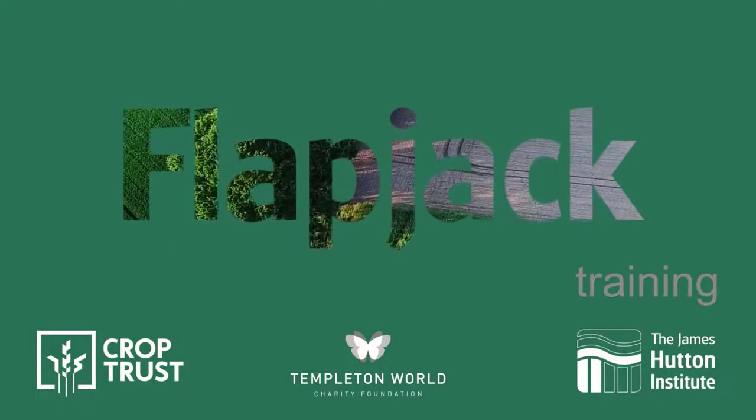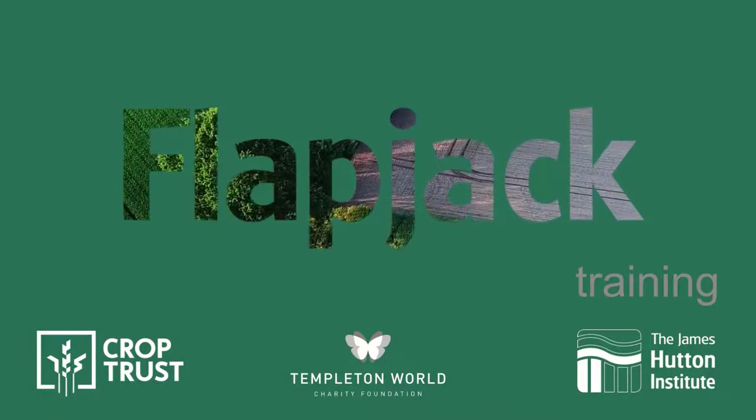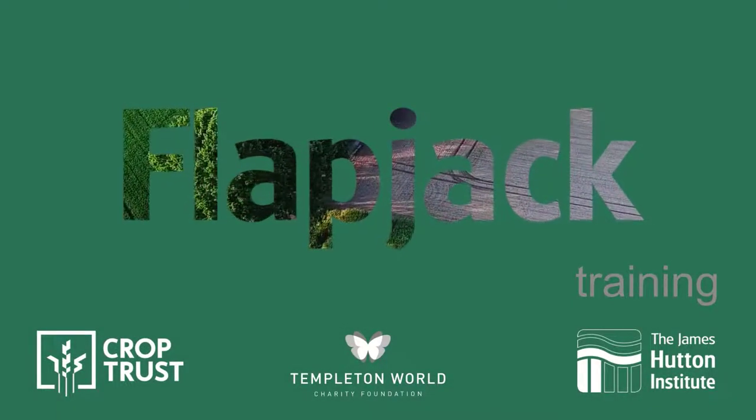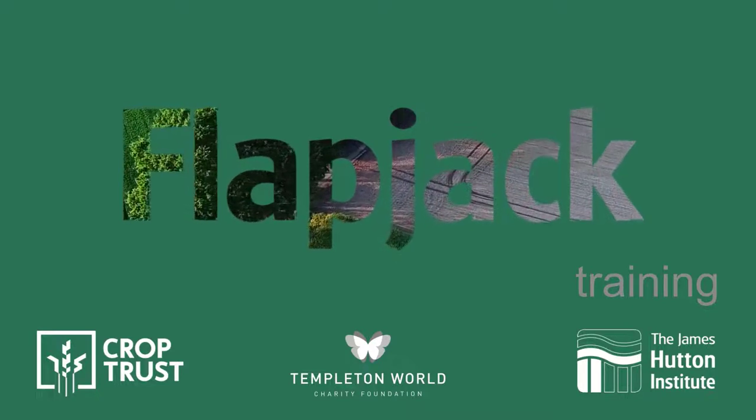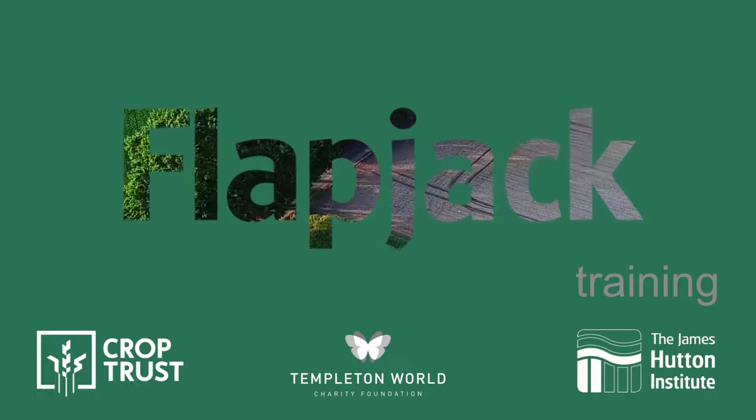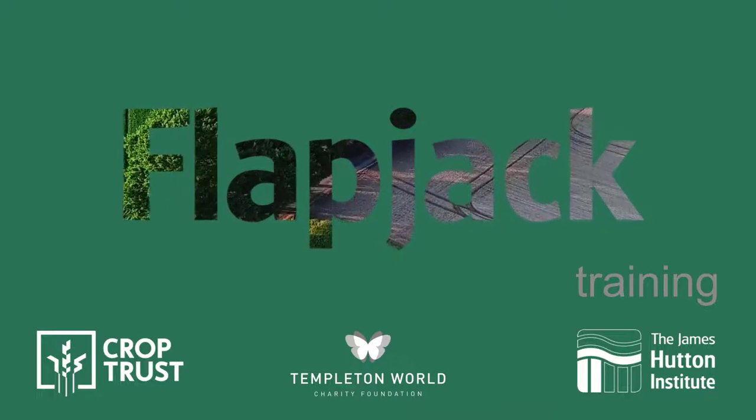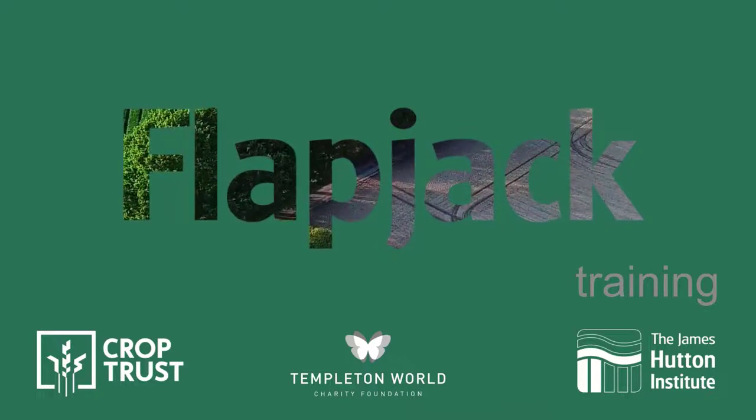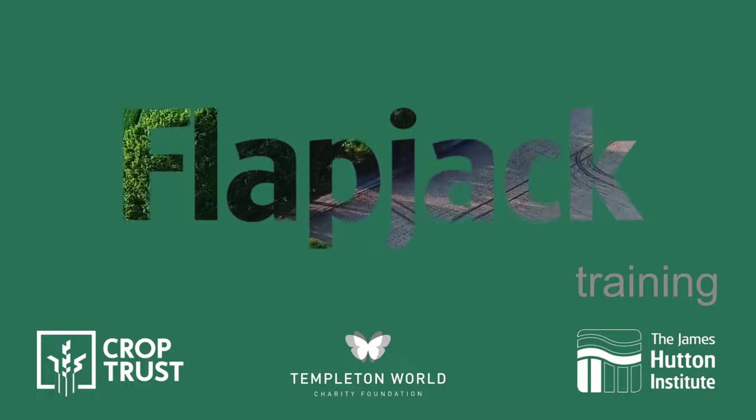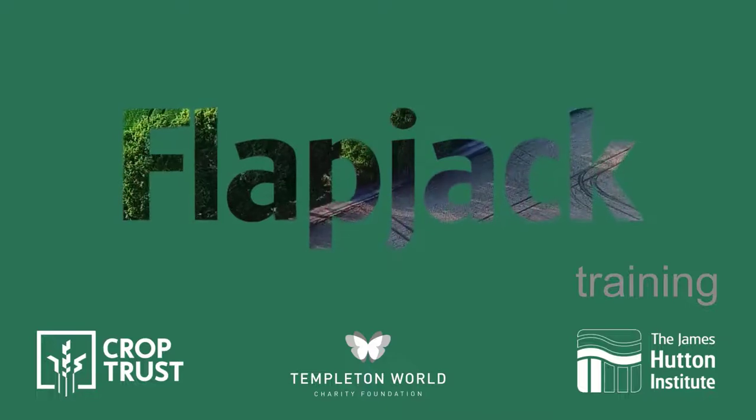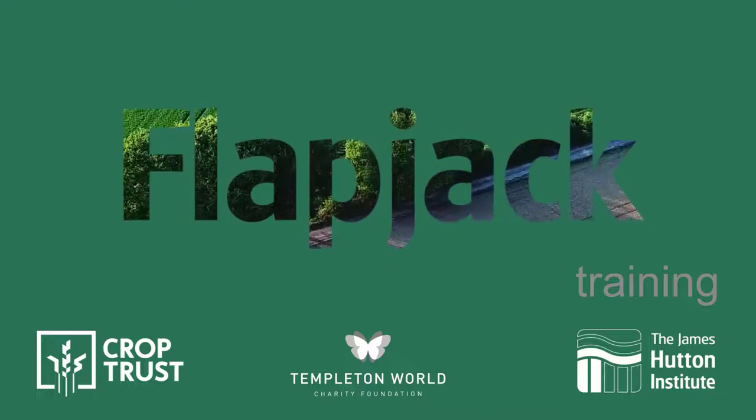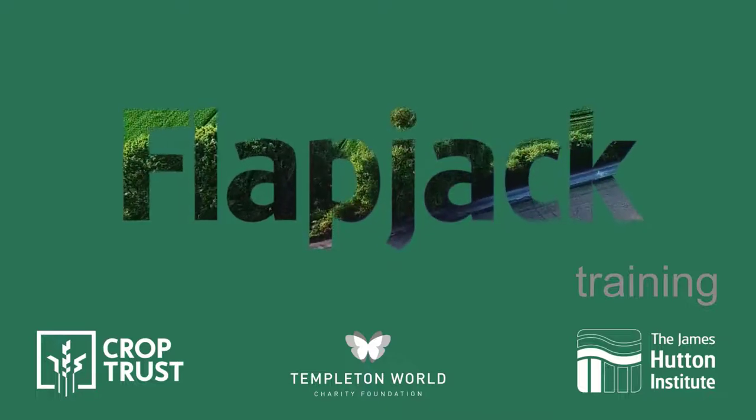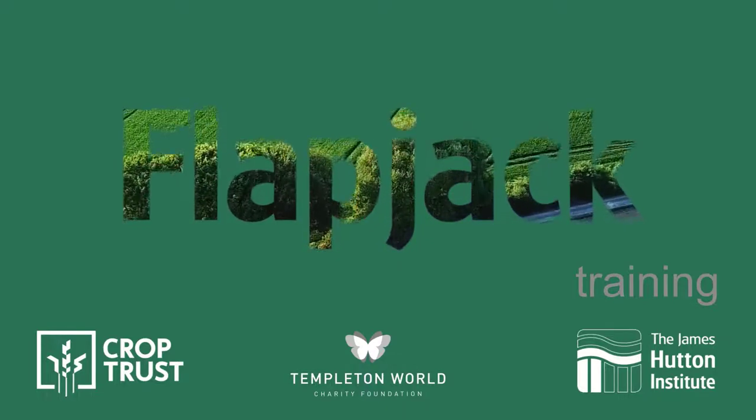Welcome to a series of tutorials exploring all aspects of Flapjack. Flapjack is an open-source, multi-platform application providing interactive visualizations and analysis of high-throughput genotype data.